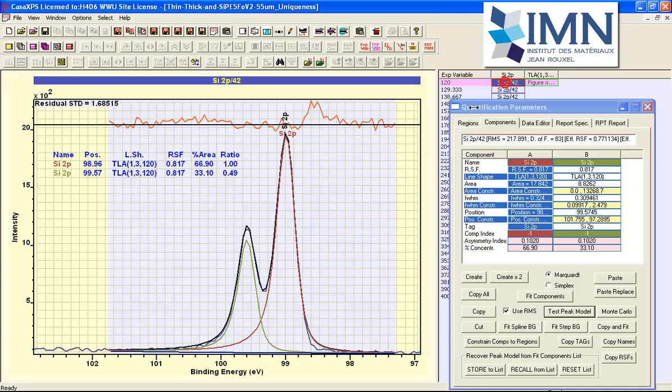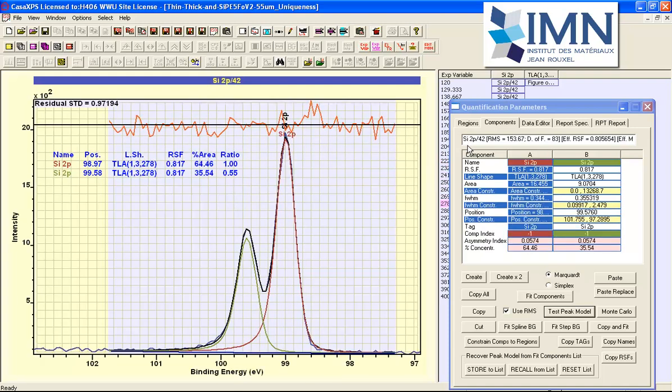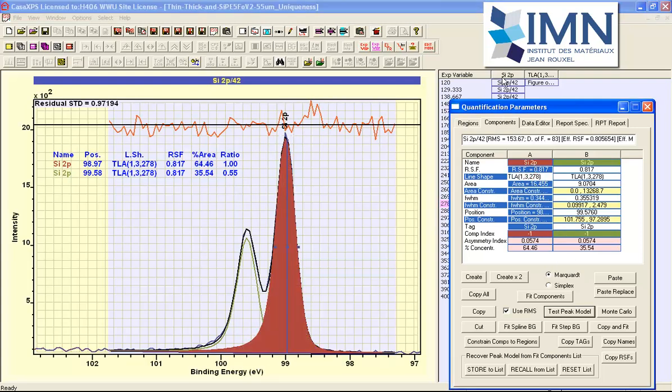So let's now have a look at this, and we'll scan down these spectra and look to see what kind of adjustments we've got. Well, we've got some changes in the shape here. We've also lost some of the signal here. So as we increase the Gaussian contribution, we are losing something over here. So let's now take this point, and I'm using the data file that was created from the original file as part of the scan because these are the same data.